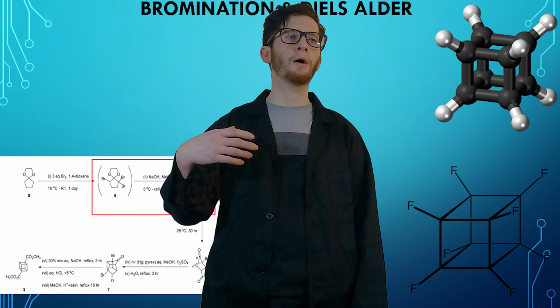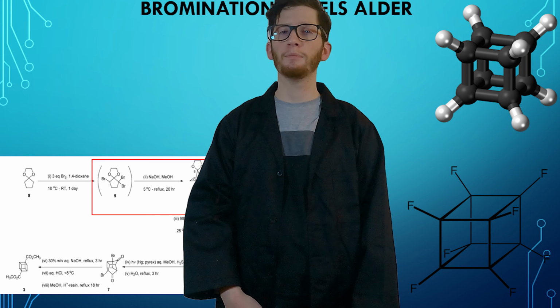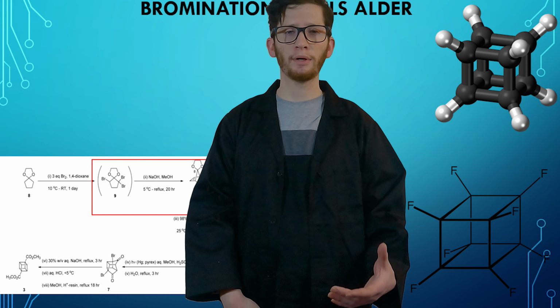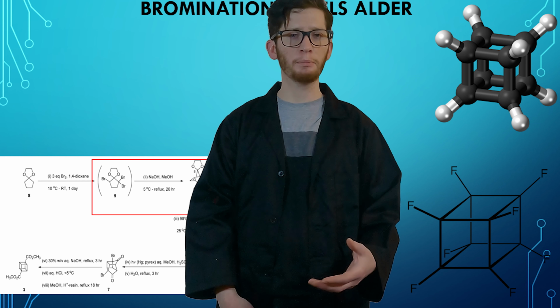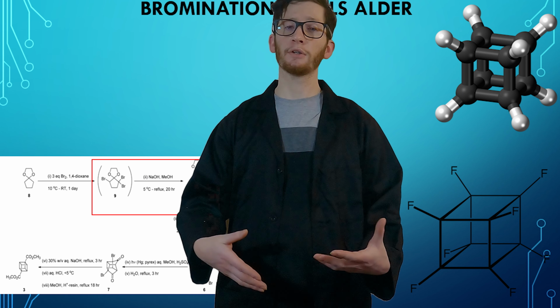And then we have our photoreactor step, which I'm quite confident about. I've been doing a lot of research on it, and I think I have it down. I'm going to be turning it into a flow reactor as well. So I bought a peristaltic pump and FEP tubing for the UV light to pass through. I think it's going to work out really well.